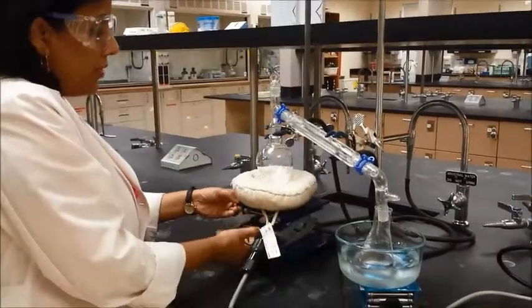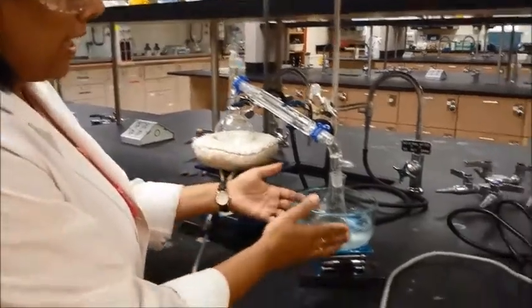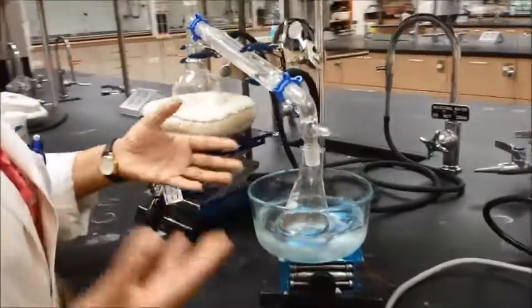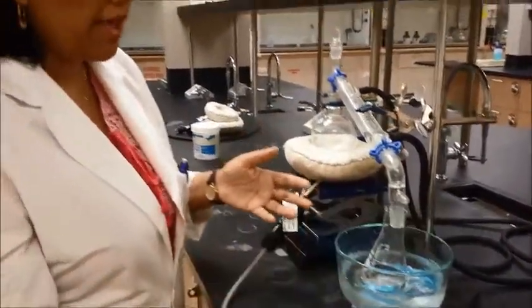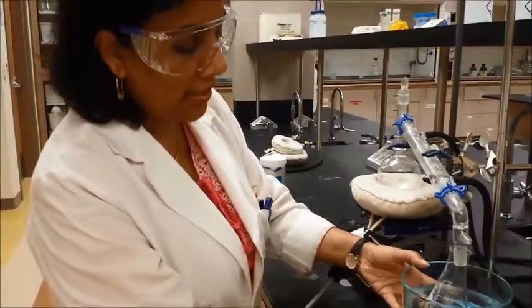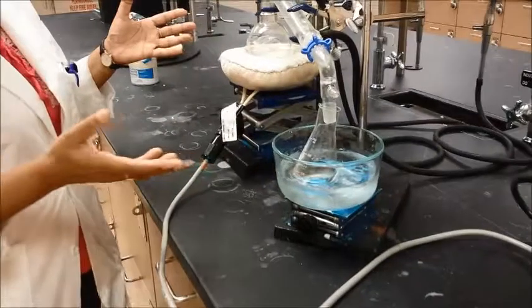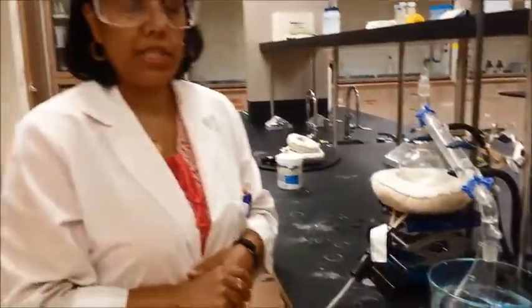Once you're ready to heat up, you can go ahead and elevate the lab jack. For the collection part, you will need an ice bath. Depending on what you're collecting it in, you can use a graduated cylinder or an Erlenmeyer flask. You can elevate that using a lab jack. So this is how you would set up for steam distillation — exactly the same as simple distillation.